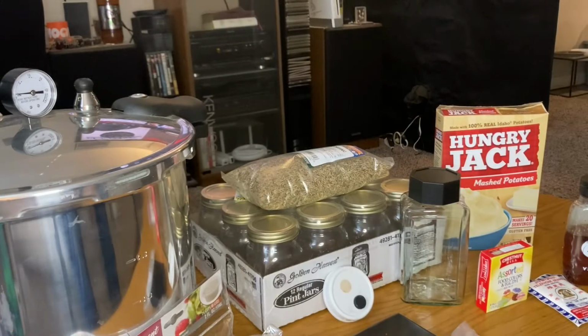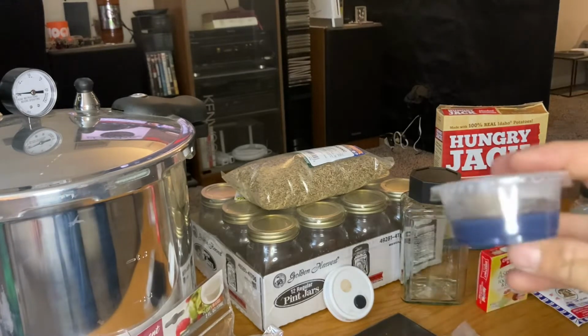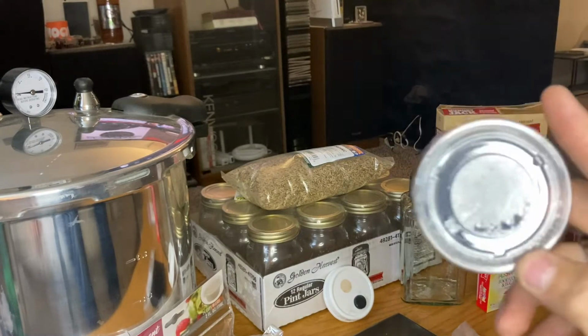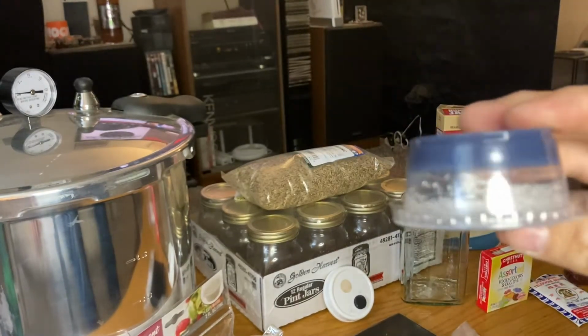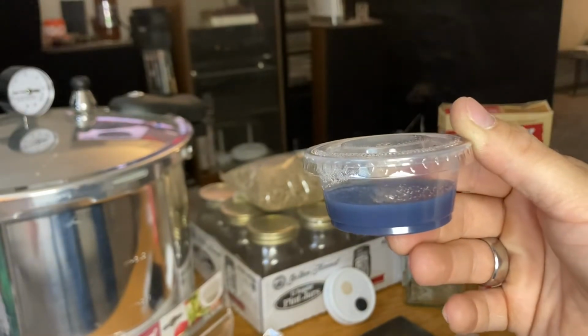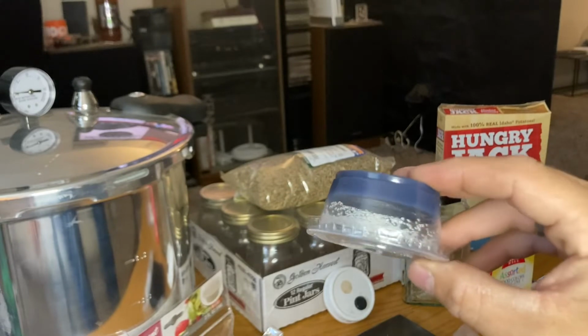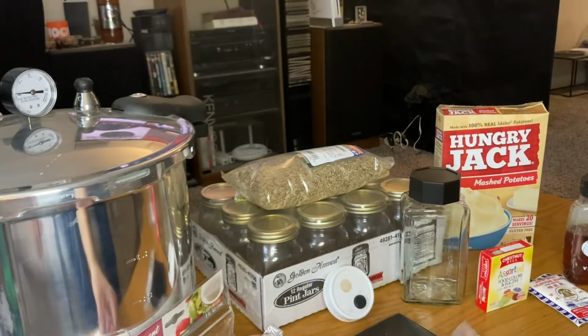We have quite a few supplies on this table that I'm going to be going over, and what they're going to be used for and how you can find them. So to start, first we are going to be talking about how we're going to make agar dishes, which will be these things. Still a little bit of moisture in there, but that is a homemade do-it-yourself agar dish. So these are going to be the supplies you'll want for that.